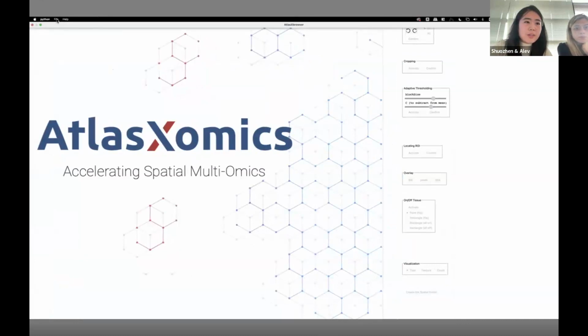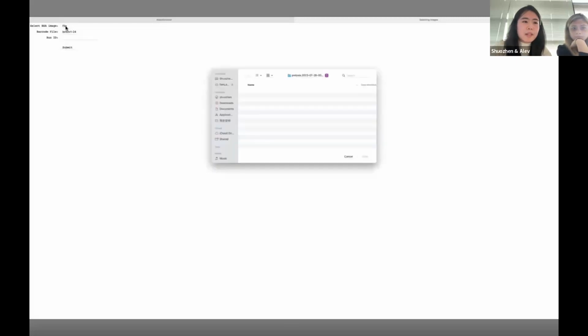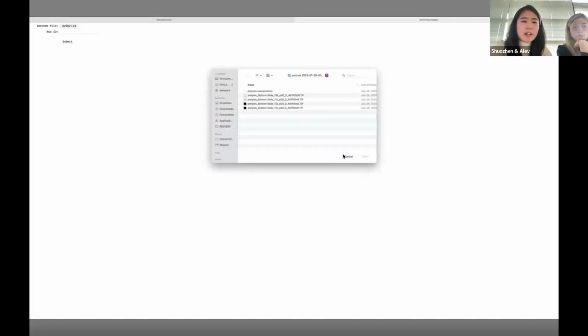We can actually use the file to begin an imaging process here. So here are several options that we can get. Here is the imaging scan. I'm just selecting one demo data that's in the Google Drive folder. It's within the 01 demo data, and it's marked as the Atlas spatial folder generation, and you've got the sample information inside. So here, there's a default barcode file loaded.